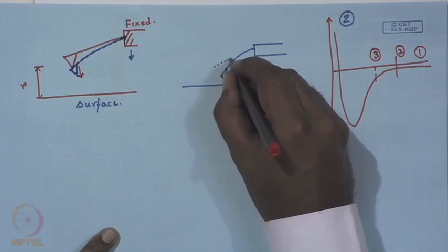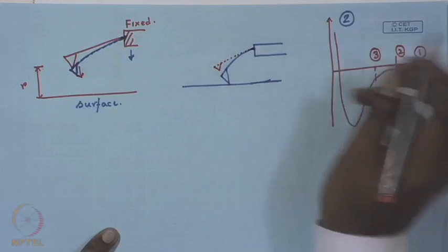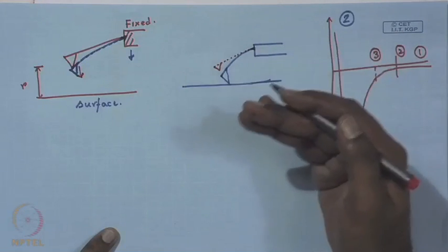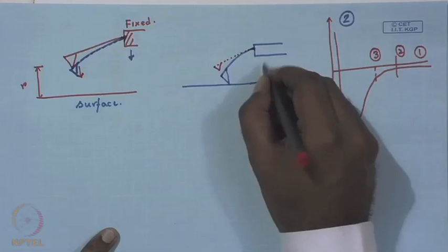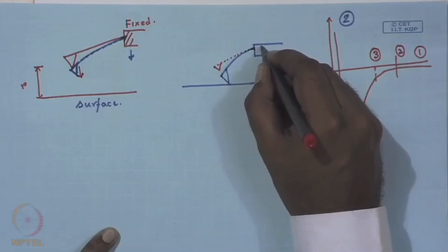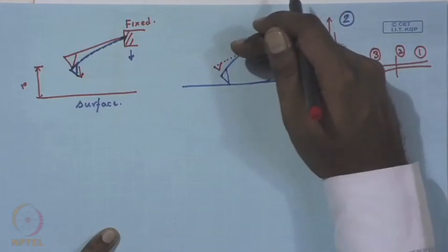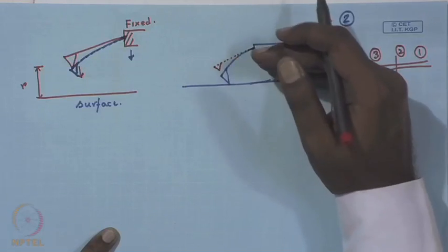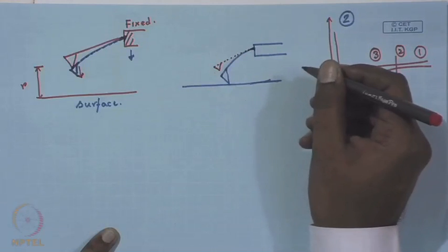So, this was the original deflection free configuration of the cantilever. Had there been no interaction force, or the spring was stiff enough not to deform to these intersurface forces, even then, because of the vertical movement of the stepper motor bringing the cantilever close to the surface, it would have touched. But let us say it would have touched at a separation distance of r0.